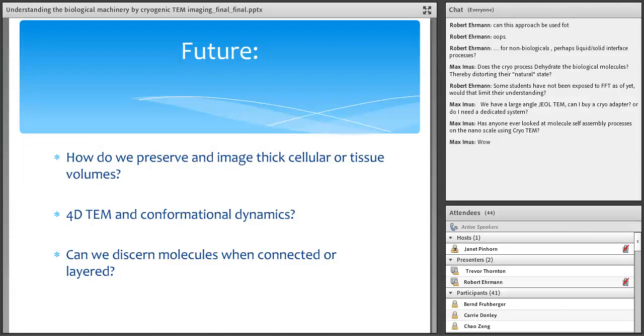And there's going to be a revolution in knowledge about the brain because of all the different optogenetic tools we've now developed and the CRISPR-Cas9 system, so we can do transformation in recalcitrant cell lines that we couldn't do anything in before. And so how do we image these tissues as well? Because we can only image through a very small portion of the cell. We can't image through 50 microns. We can only image through a couple hundred nanometers at best. So will we develop new imaging modalities using scanning transmission electron microscopy so we can see microns of thickness? Or do we figure out new ways to thin the cells so that we can then step through these volumes in a reasonable way?